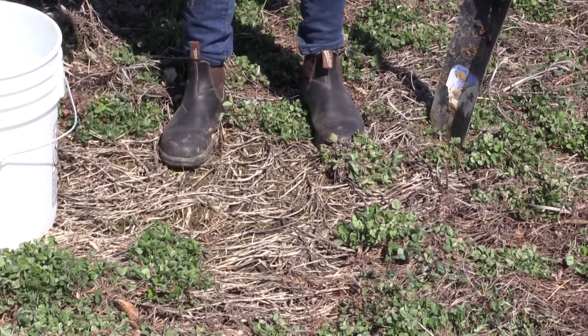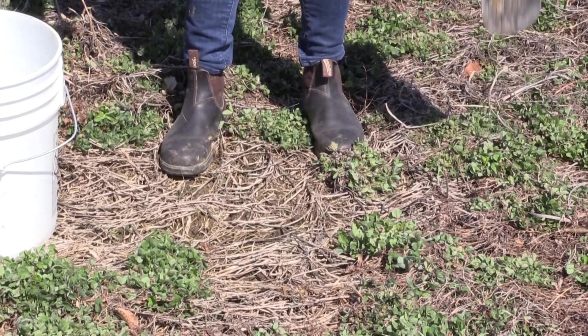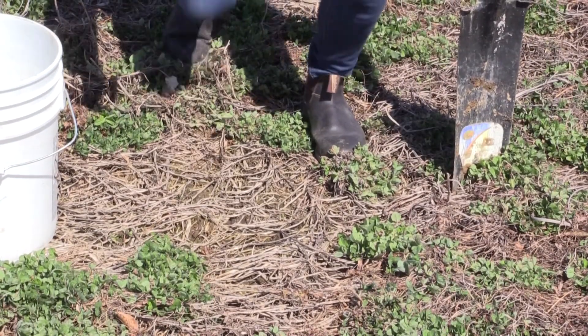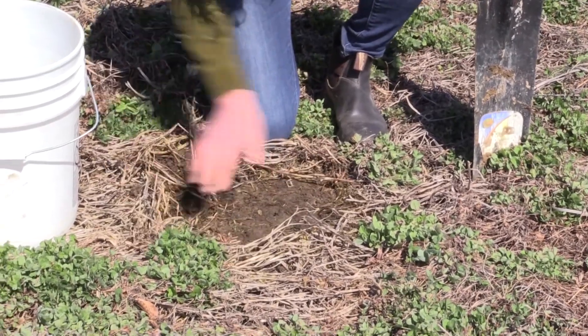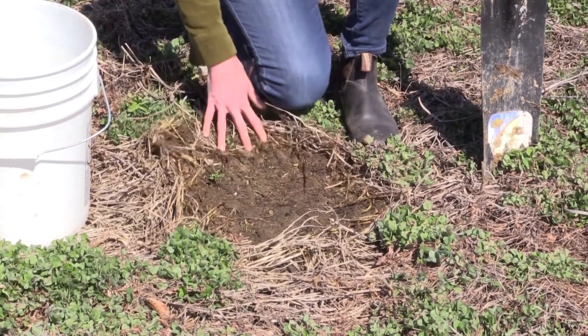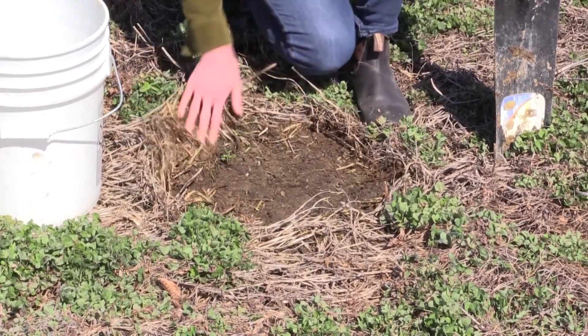I've identified that this spot is a good representation of our field. The first step is to remove the debris. You don't need to dig that deep of a hole — you're looking for about 8 inches.